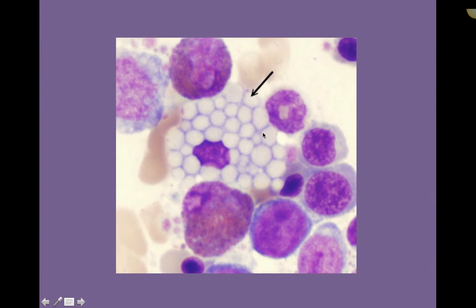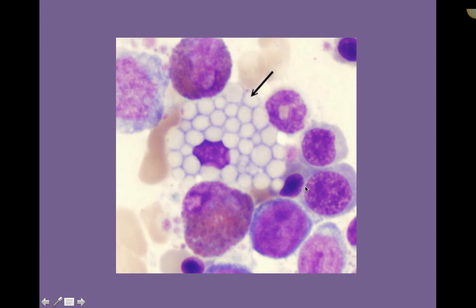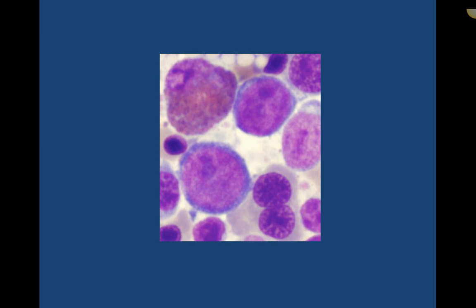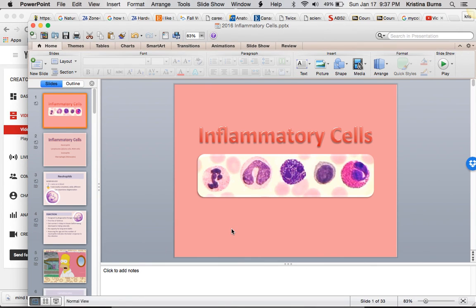Here's another mott cell. A heads-up: macrophages with excessive vacuoles can look like mott cells, but they're not. With mott cells, you'll never see one alone in the middle of a purulent or granulomatous inflammation — they're always found with their friends the lymphocytes. You never really see a plain mott cell surrounded by just macrophages; they always tend to have plasma cells and lymphocytes around them.